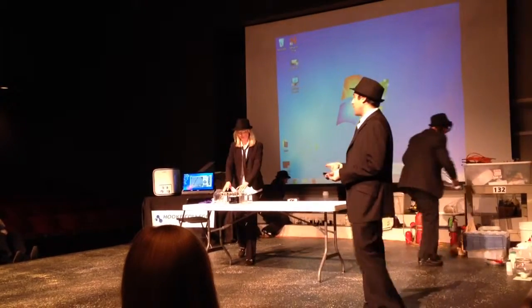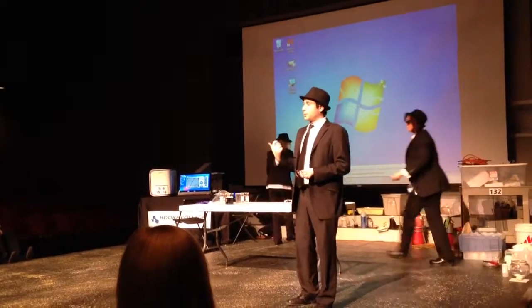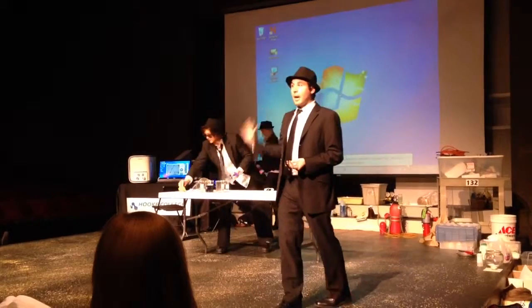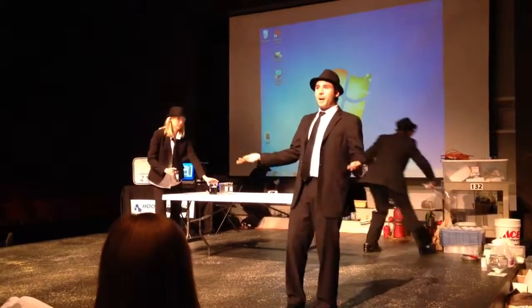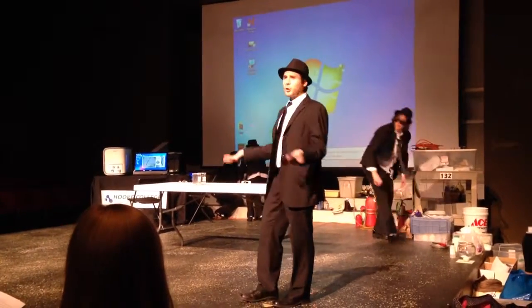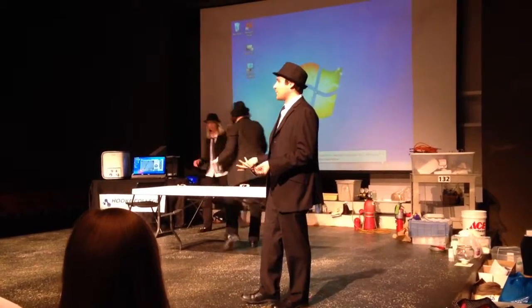So it's a few days in the lab, but there's a lot of graphical analysis that goes along with it, as well as getting to jump in and do a really cool chemistry demonstration on their own. Because think about it: you have two clear, colorless liquids, all of a sudden you put them together and that iodine reaction rings.